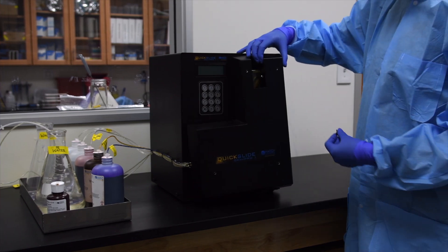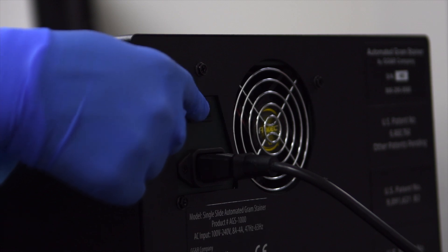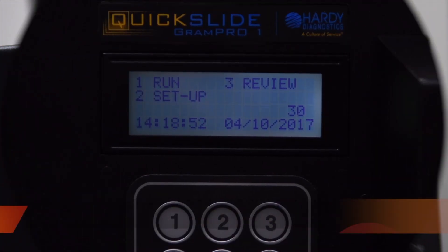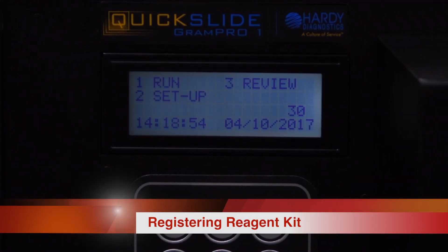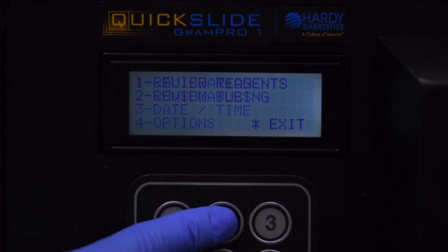The panel covering the pump tubes can now be replaced. Power on the instrument by pressing the on switch in the back. From the main menu, press 2 on the keypad to select Setup, then press 2 again to select Consumables.